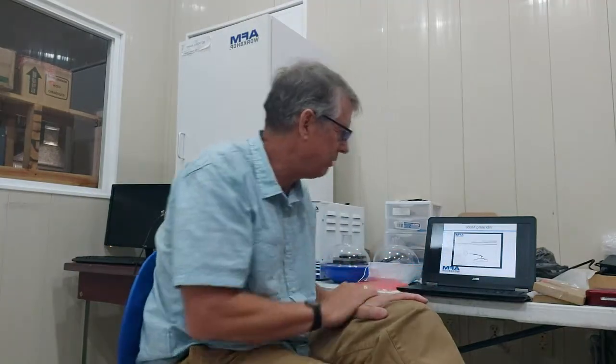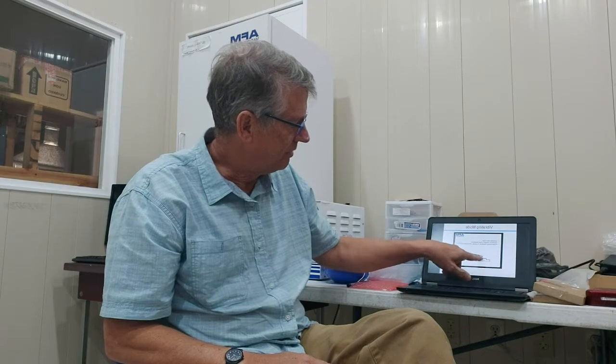So in vibrating mode, you scan over the surface, and the needle can come in and out of the contamination. But you keep the vibration amplitude the same. So the feedback loop is activated to keep that vibration amplitude the same. When you scan in vibrating mode, the cantilever vibration amplitude stays the same, and you don't push the material around.